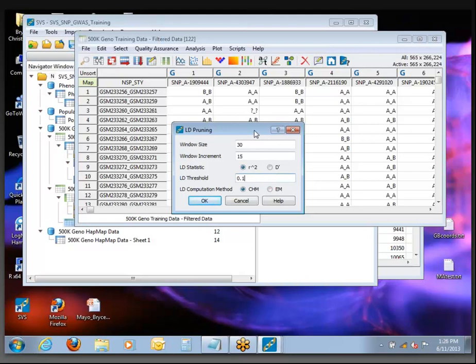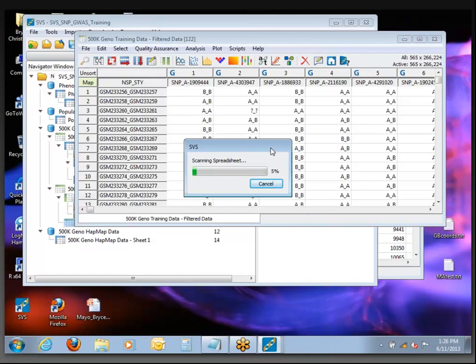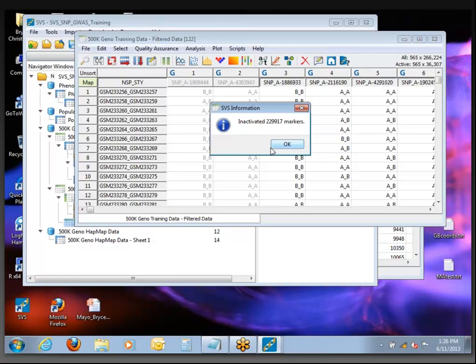Has everybody got their settings put together? The settings I used there were mostly for computational efficiency. You may want to adjust in your own work. LD pruning turns out to be helpful in a lot of different situations — whether it's creating a subset for running PCA, creating a subset for running IBD analysis, or even developing a custom chip. We have a customer working with chickens who had a lot of sequence data — after discovering millions of SNPs they wanted to build a chicken GWAS array — and you can use this function to get down to a set of tagging SNPs that will capture most of the important genomic variation.